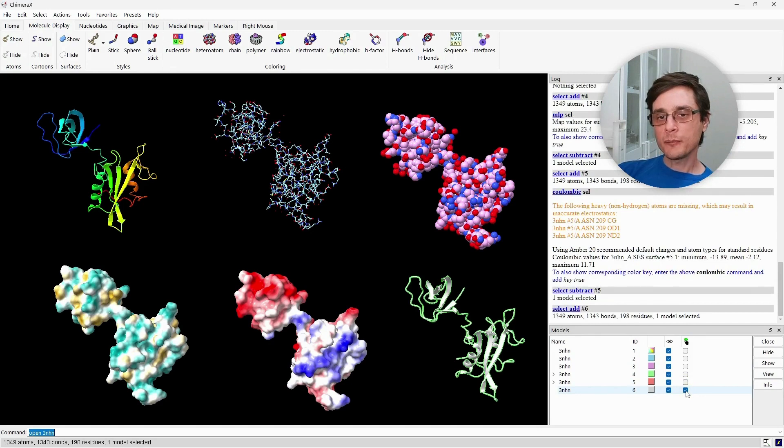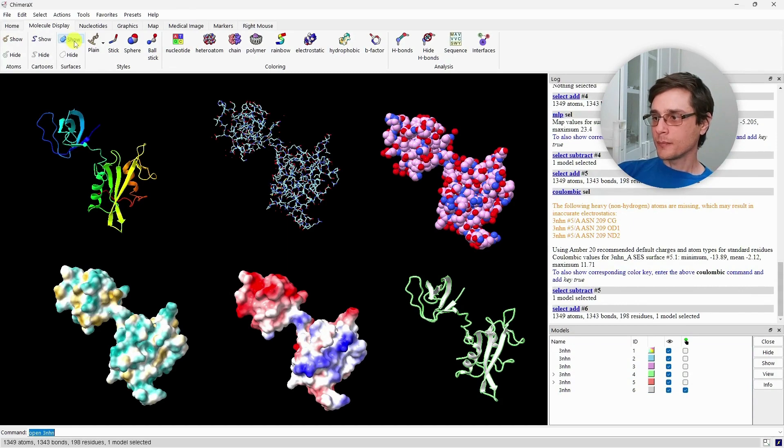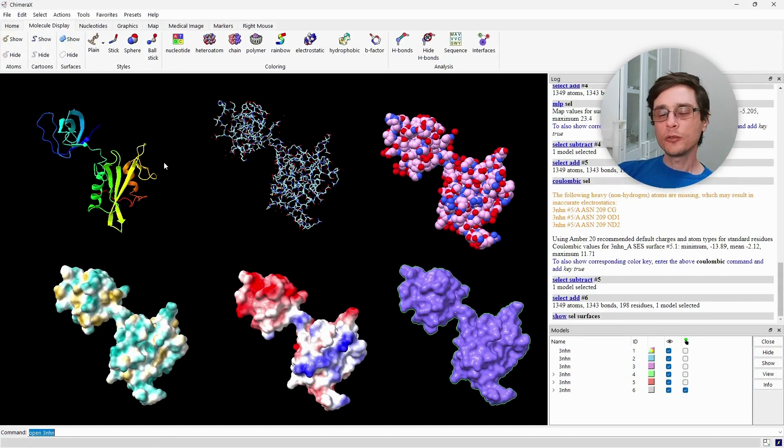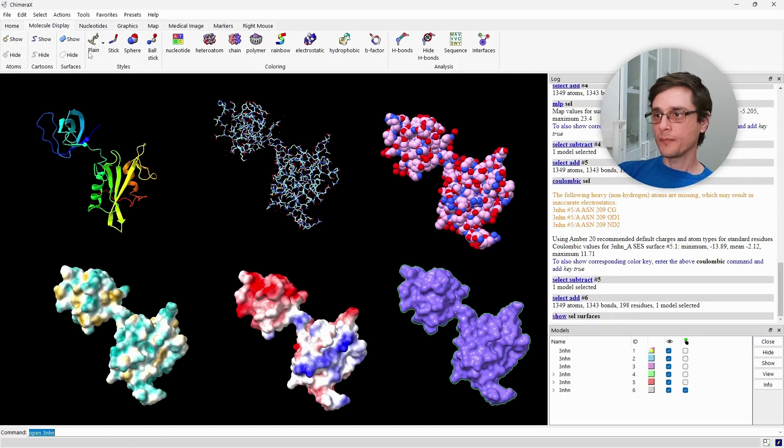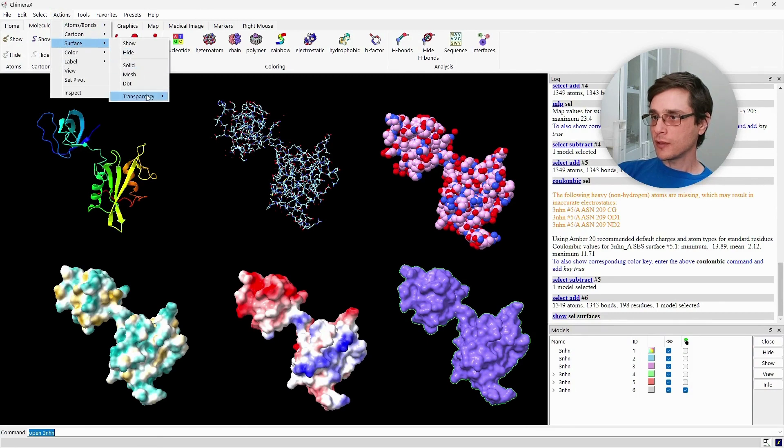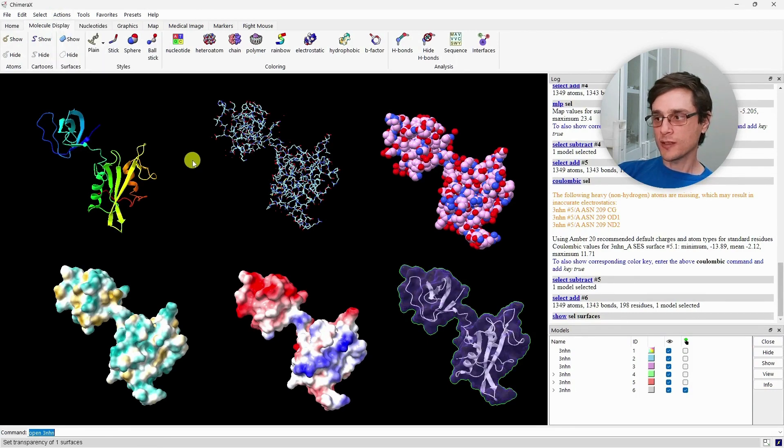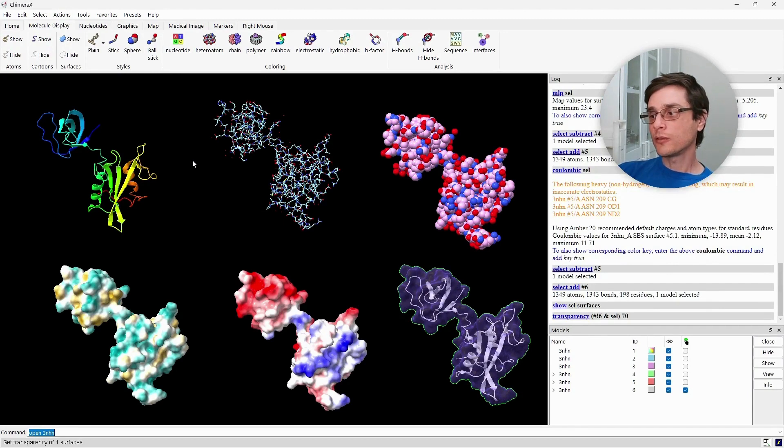For the last example, we'll do something a bit more interesting. We will add a surface, but we don't want it to cover the cartoon entirely. We want to make it semi-transparent. So we'll go to Action, Surface, and set its transparency to something like 70%. And now we can see in one representation both the cartoon and the surface of the protein.